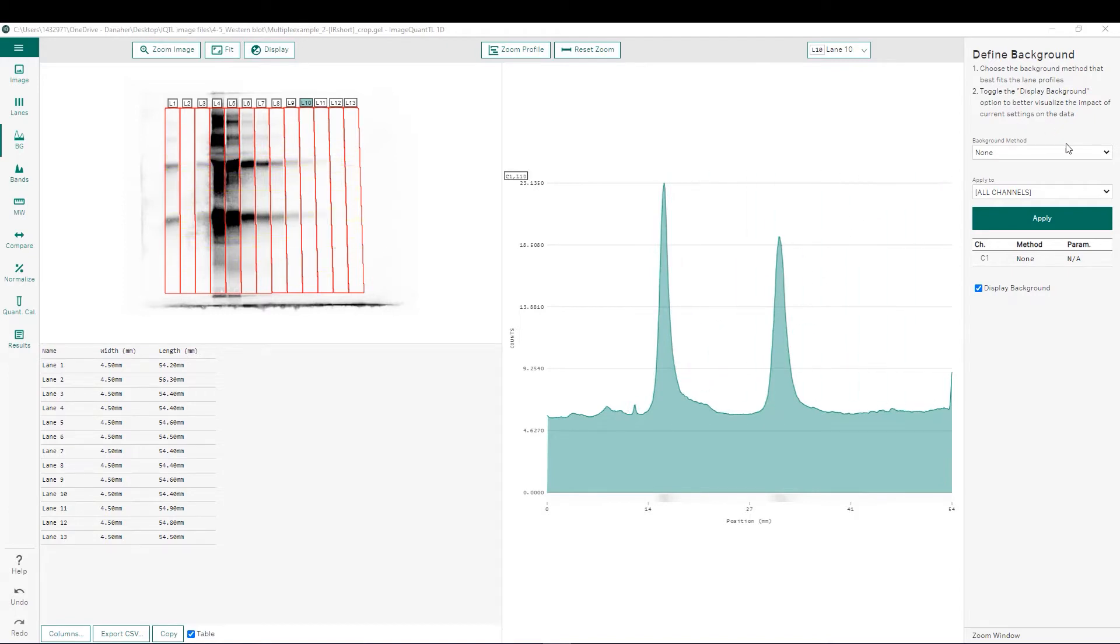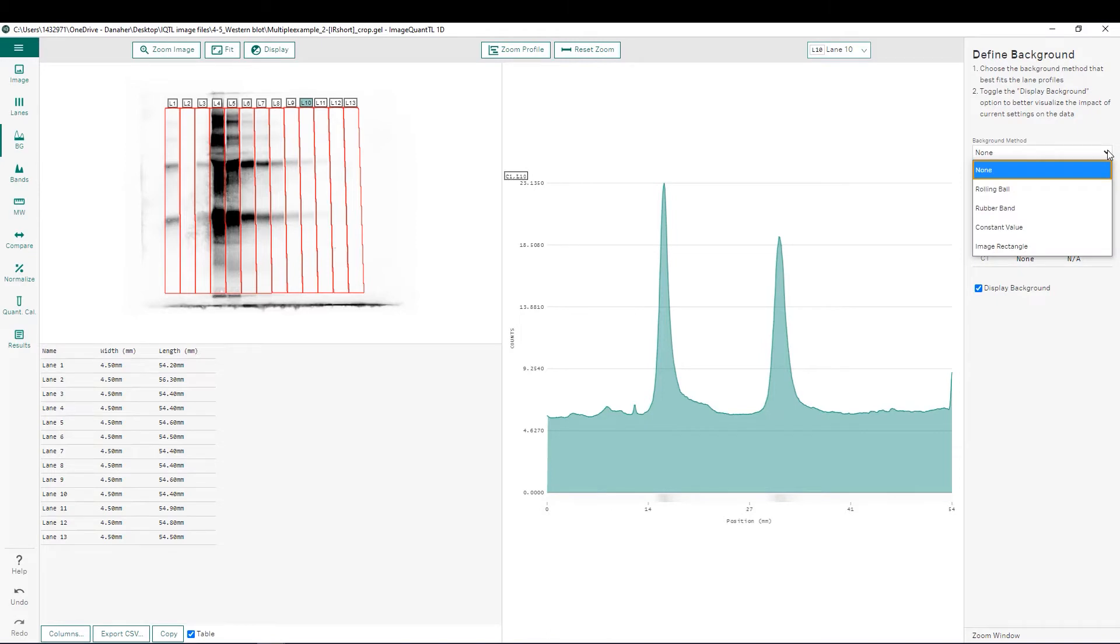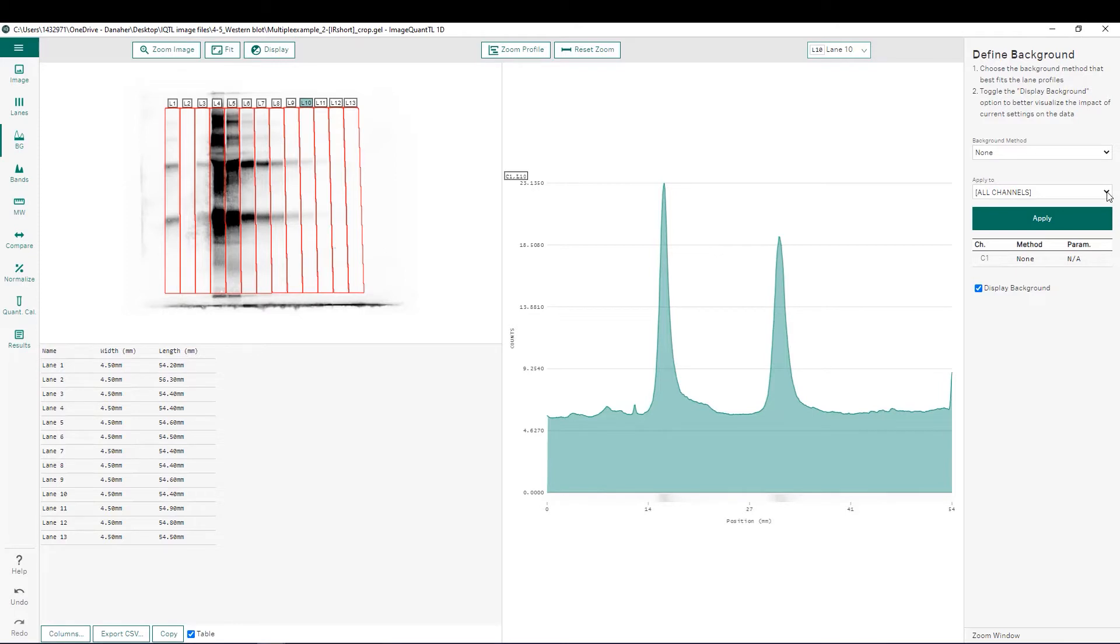To the right, we have a pulldown menu to choose which background subtraction method we would like to use. And we also have this pulldown menu if we were analyzing a multiplex image, you could choose which channels you'd like to apply the background subtraction to. Below this, we have a checkbox for displaying our background, which we will utilize to see what different background subtraction methods are doing to our image.